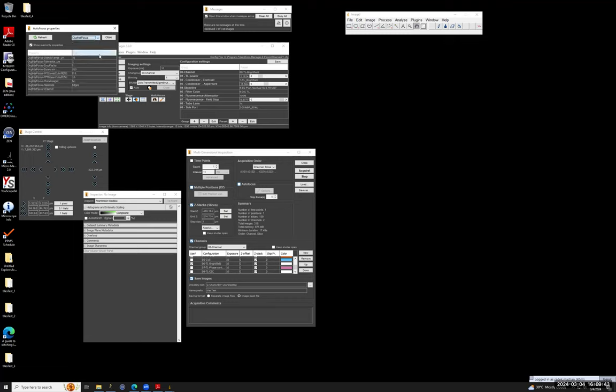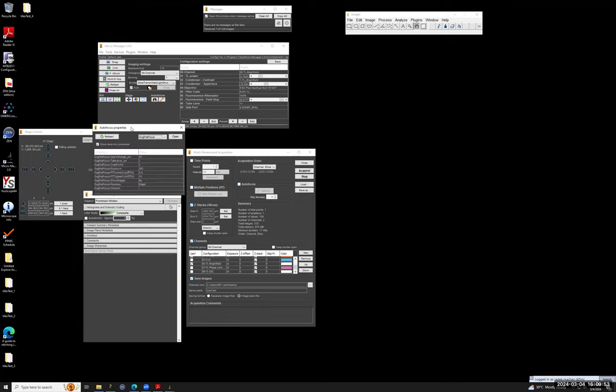And then I can set here, tune the settings. So unlike maybe in some commercial software where the autofocus is more pre-tuned, here it needs a little bit of setting in order to make it work. So for example, the range you need to set, because depending on what objectives you are using, different ranges might make sense, and the exposure so that it's not overexposed.